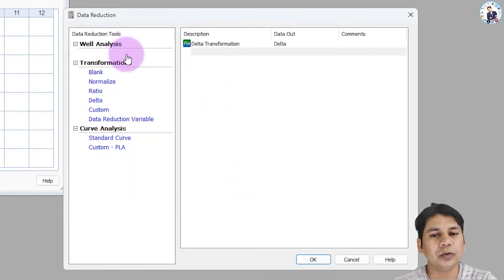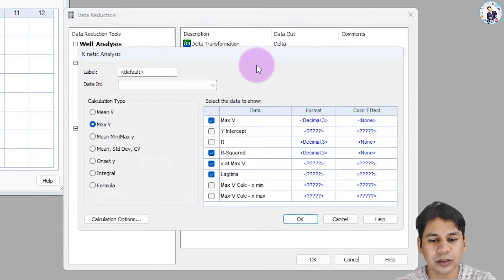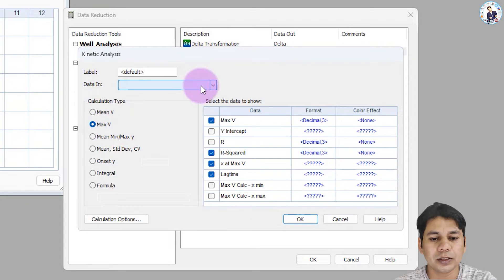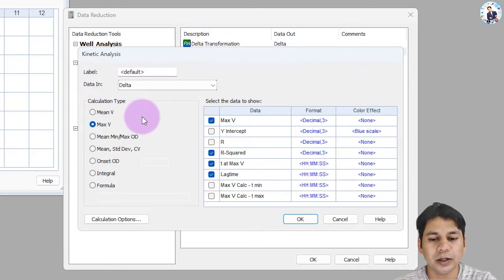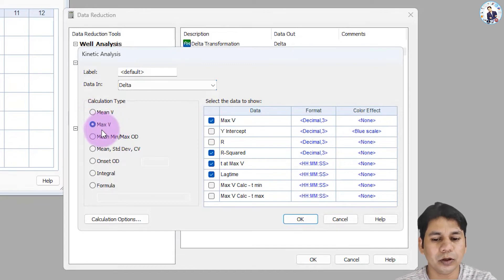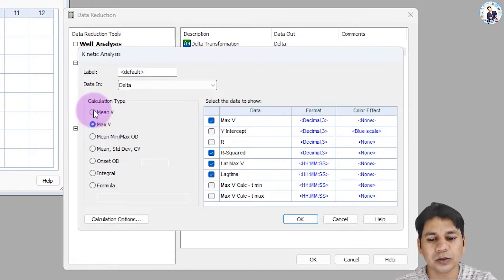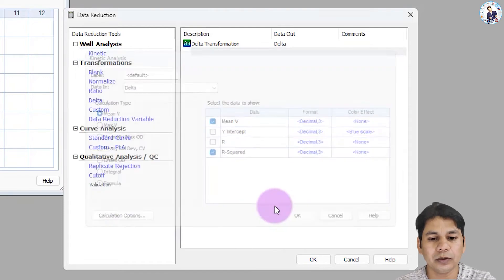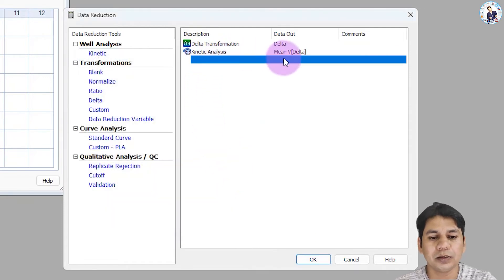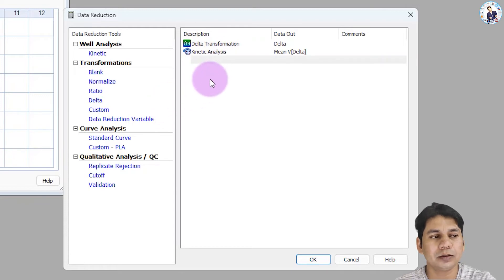After delta reduction, we click on well analysis kinetic for this assay. For this assay, we are using the delta value and calculating the mean value — not the max value — so I am selecting mean. Click OK. You can see the kinetic analysis mean value has been added.